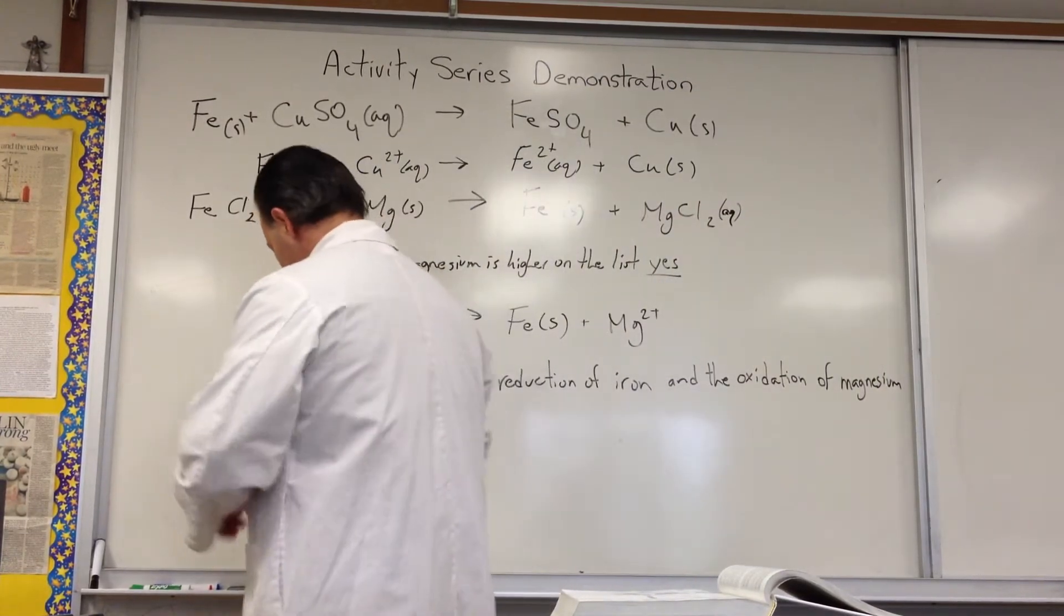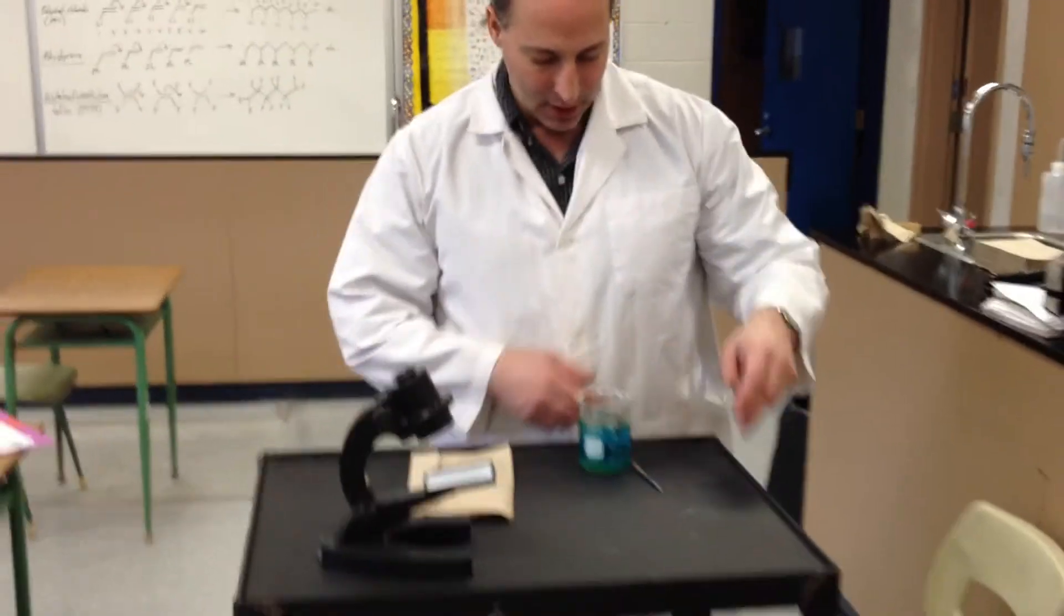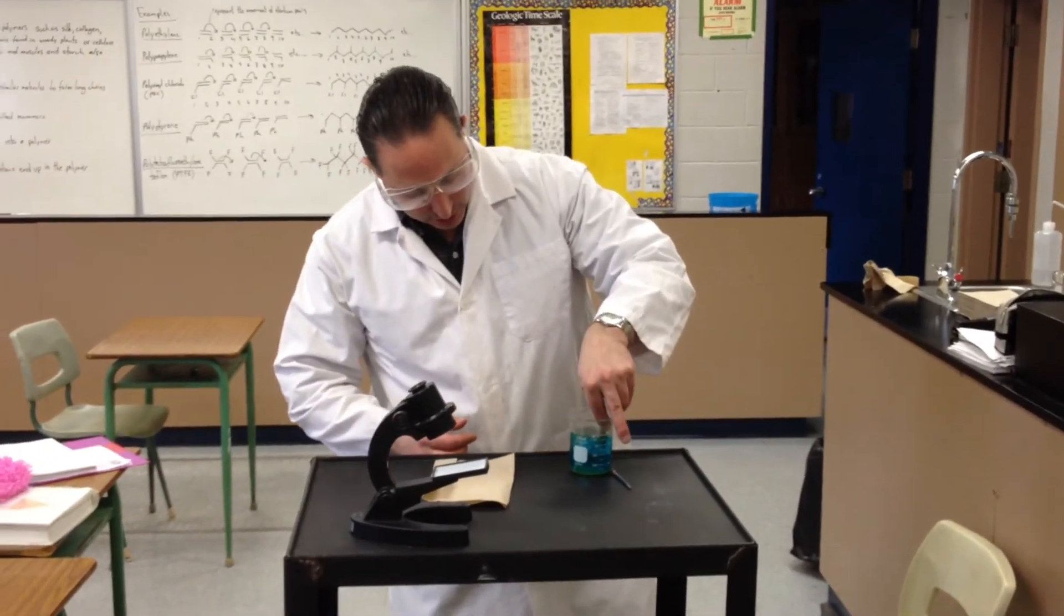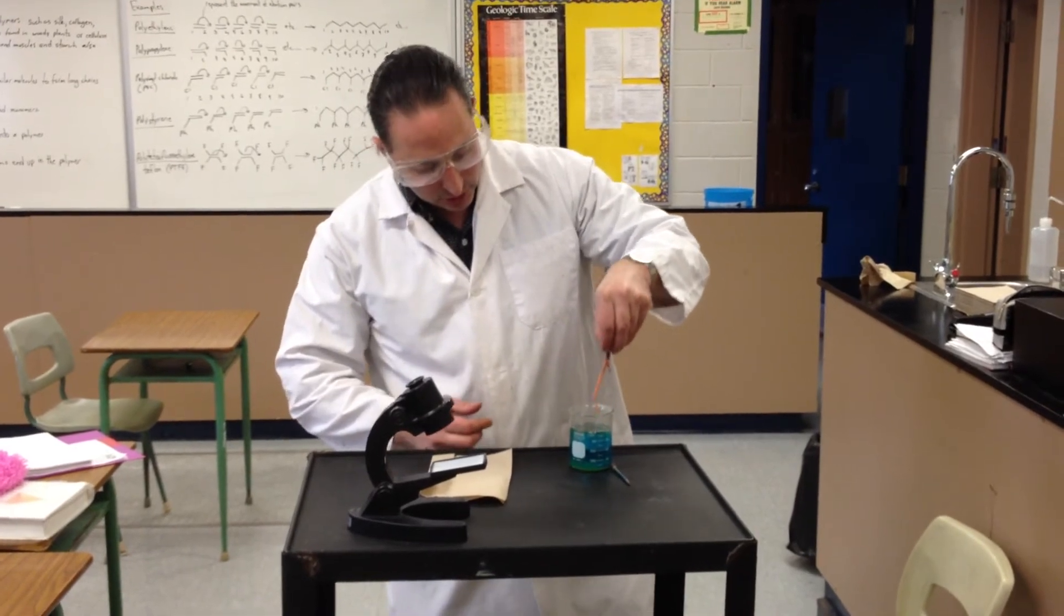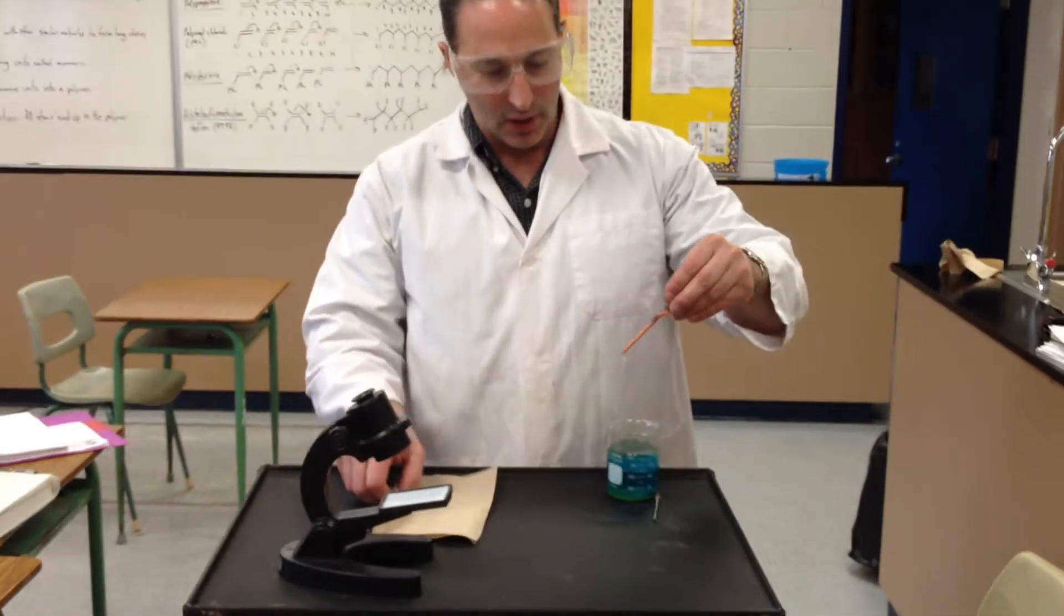Here we have a sample of copper sulfate. This nail was placed in the solution overnight, so it was allowed to accumulate copper. If you look closely, you'll see there's a thick layer of copper on the nail.